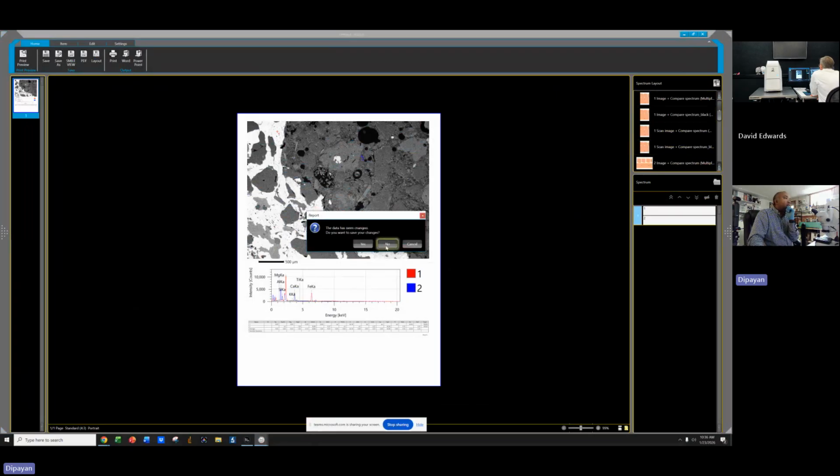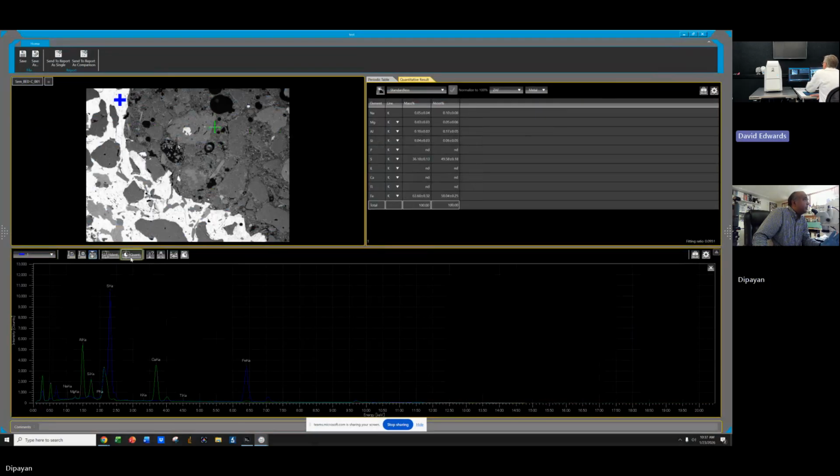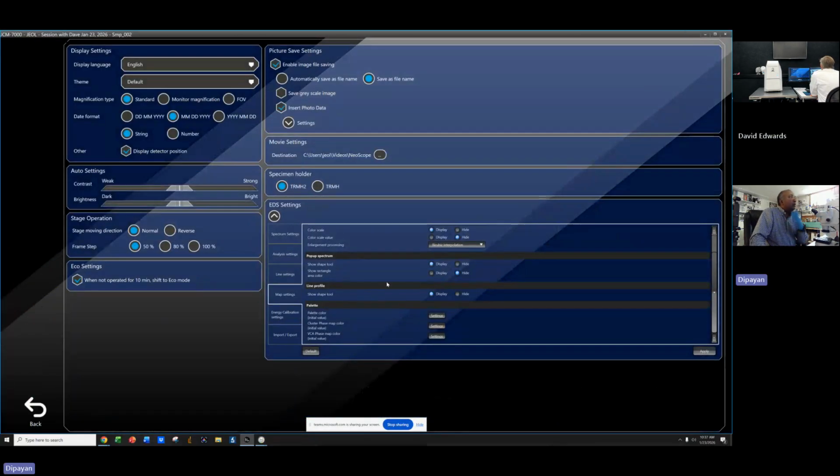Let me go back and show you what I did. Yep. Okay, I understand. So I don't need to press this quant anymore, you are telling. Right, you don't need to. It's already there, and it's that upper right window if you select the quant results. Yep. Yeah. Okay. So. And again, that's only for spectrum. It is not for maps. Right.